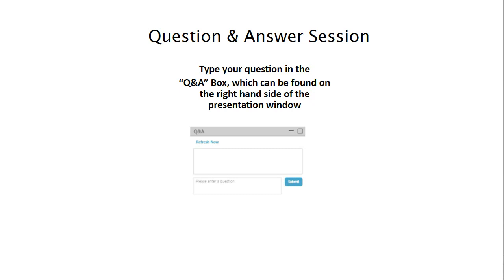Why does low temperature cause low protein recovery? Ooh, that's a complicated physical biochemistry question, and it's been addressed in a few different ways with model systems. It's not clear to me what that is. There could be some aggregation going on, resulting in essentially stuff sticking in pores.